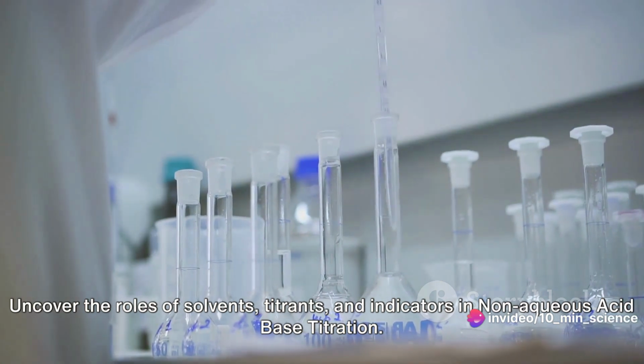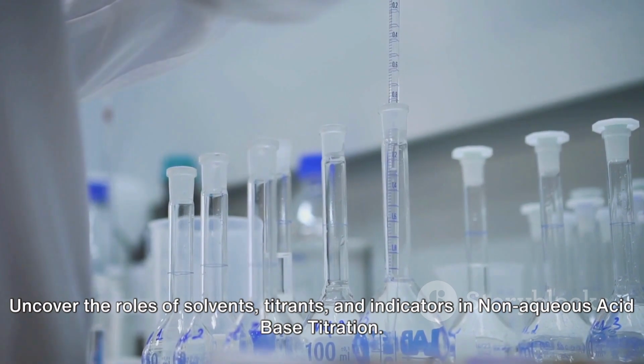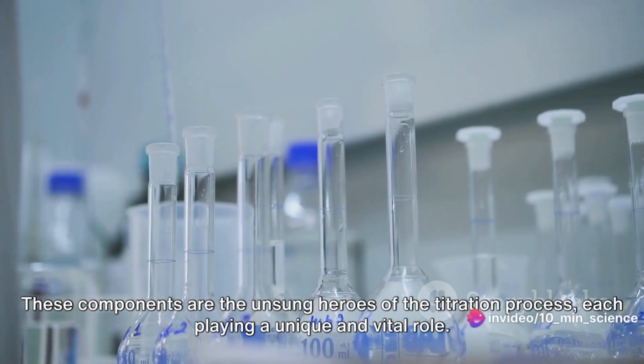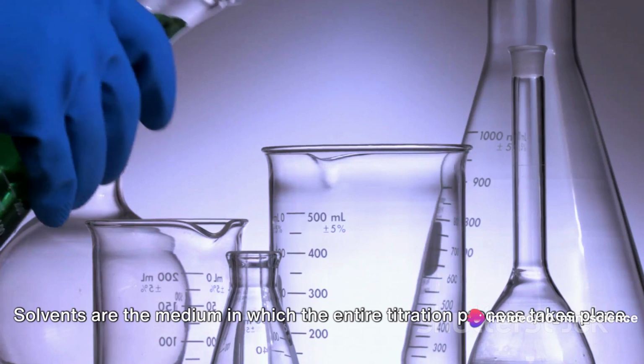Uncover the roles of solvents, titrants, and indicators in non-aqueous acid-base titration. These components are the unsung heroes of the titration process, each playing a unique and vital role. Let's begin with the solvents.